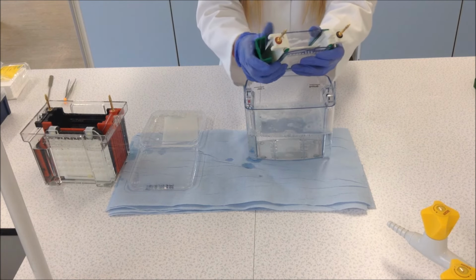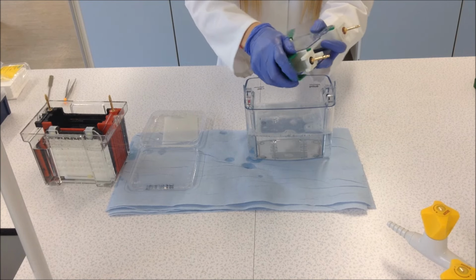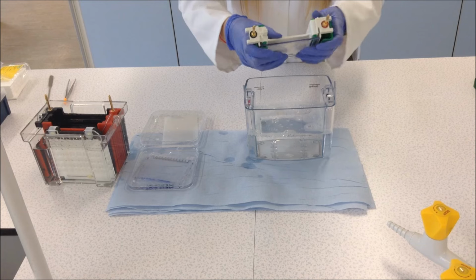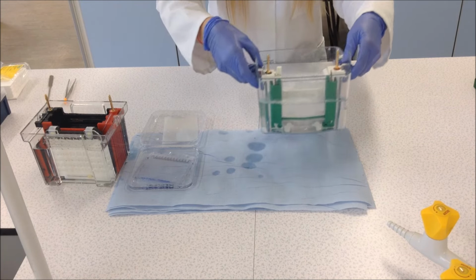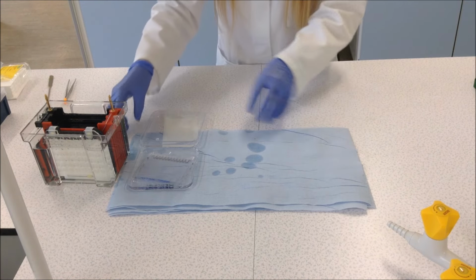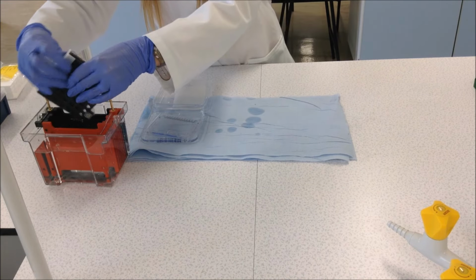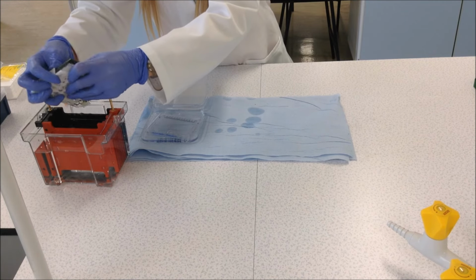You can then unclip the assembly and remove the polyacrylamide cassette from the assembly. If need be, you can place the polyacrylamide into buffer while you tidy up the area around you. Now you are ready to begin assembling your blotting module, remembering to remove it from the transfer buffer that we have left it to soak in.